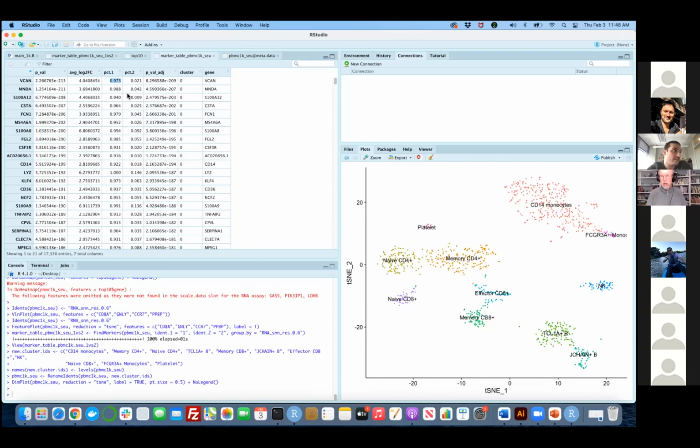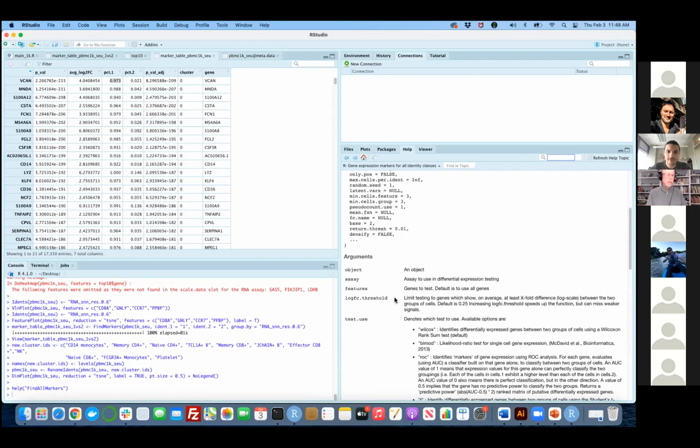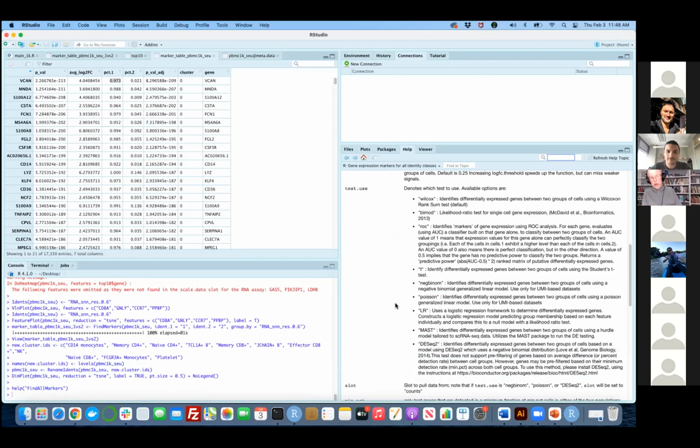It's the Wilcoxon test, but you can actually change it. So you can go for help on find all markers. So that would be, okay, if you're using a non-parametric test like Wilcoxon, that would explain those extreme p-values because you're looking at every pair against every pair, and if you've got 30,000, it mounts up pretty quickly. I gotcha. Okay. Definitely.